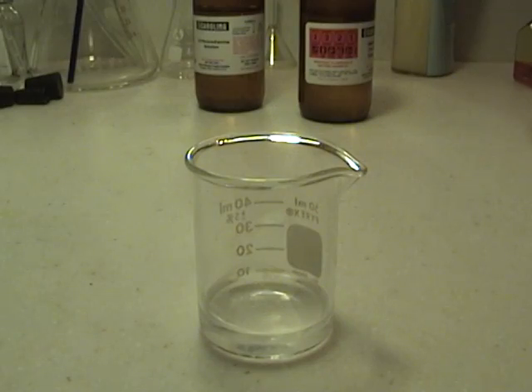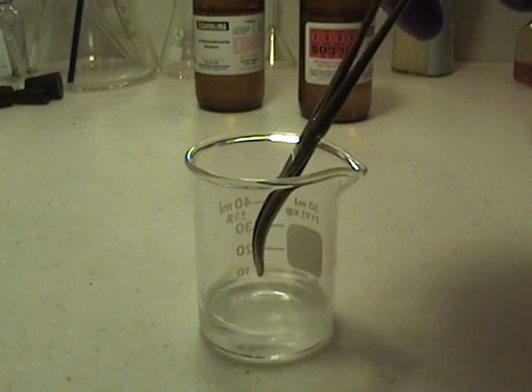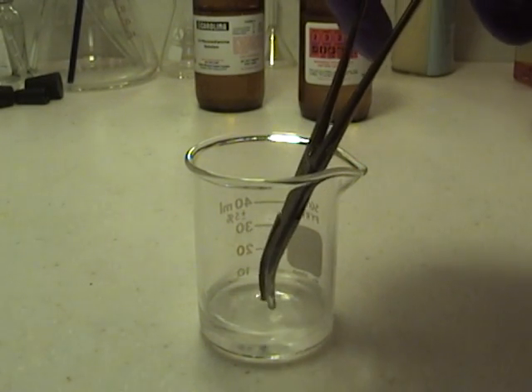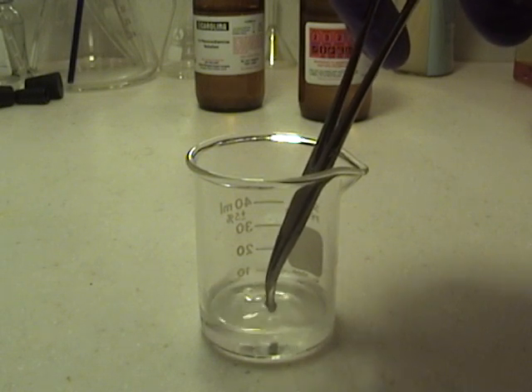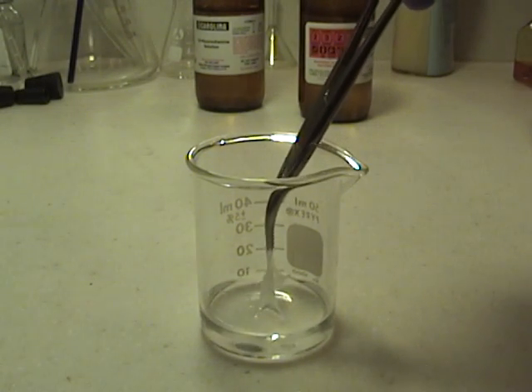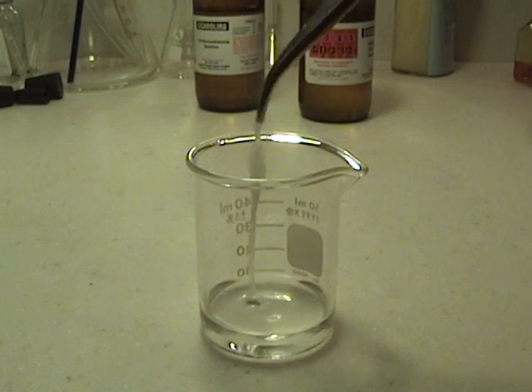Now we are going to attempt to take the nylon out and wrap it around a stir rod. So you want to take your tweezers or forceps and reach in and make sure you go down to where the two liquids meet. You are going to grab that layer there and pull that out.